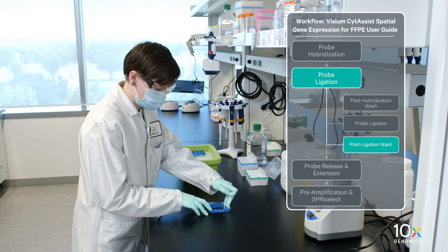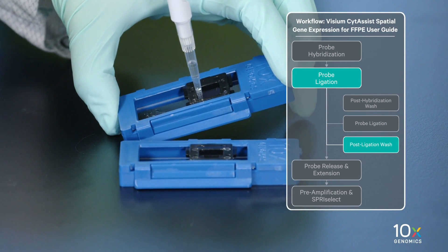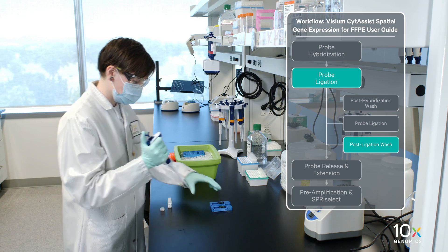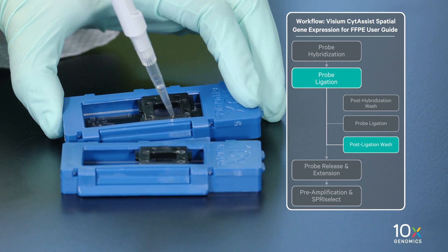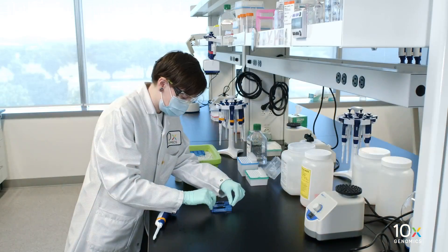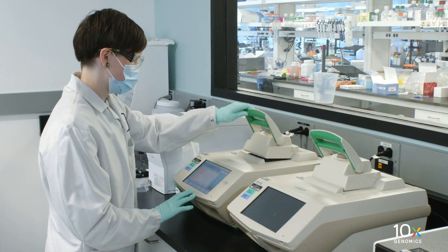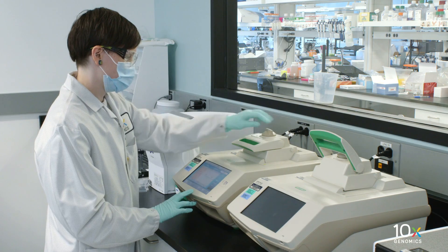Remove the Visium Slide Seal. Using a pipette, remove all probe ligation mix from the wells. Immediately add 200 µL of room temperature post-ligation wash buffer to each well. Removal and addition of buffers should be done quickly. Apply a new pre-cut Visium Slide Seal on the tissue slide cassette and place on the low profile thermocycler adapter on the preheated thermal cycler. Close the thermocycler lid. Incubate at 57 degrees Celsius for 5 minutes.